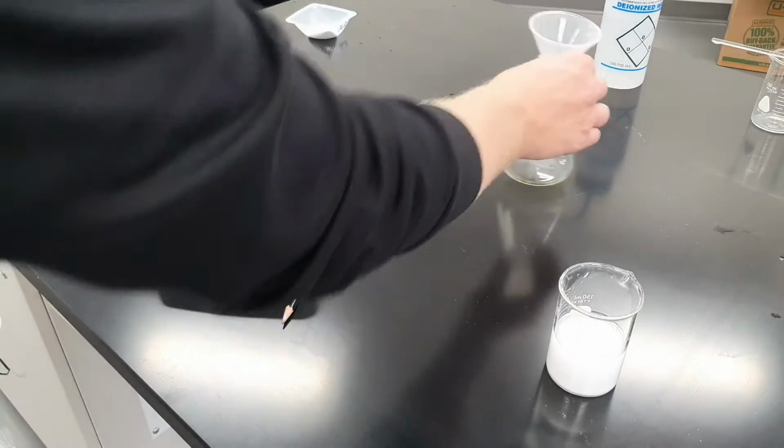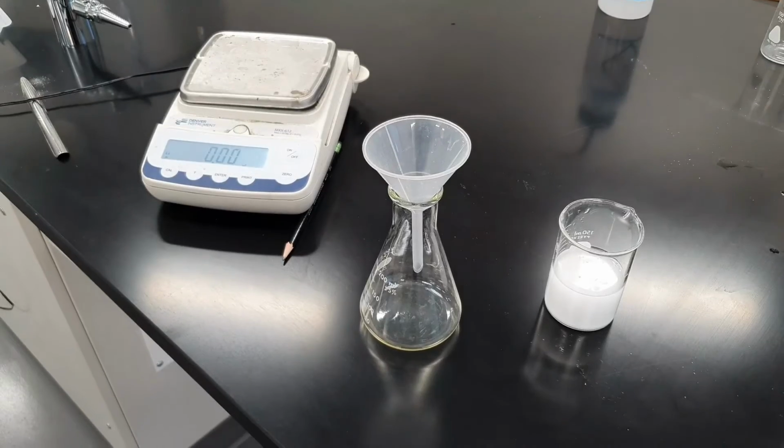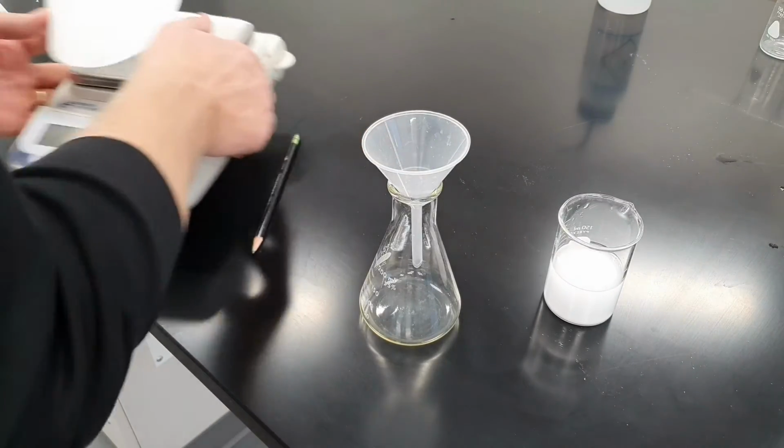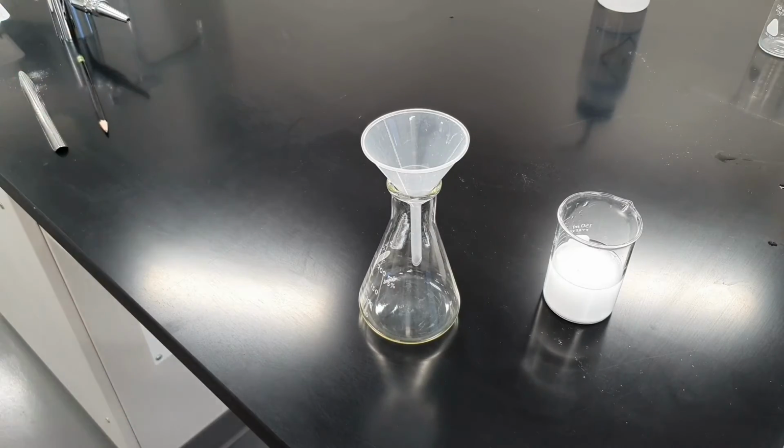So now the next process of this is we're going to filter. So we've got our Erlenmeyer flask set up here with a funnel. We're going to fold the filter paper, and then we're going to pour our solution through and see what happens.